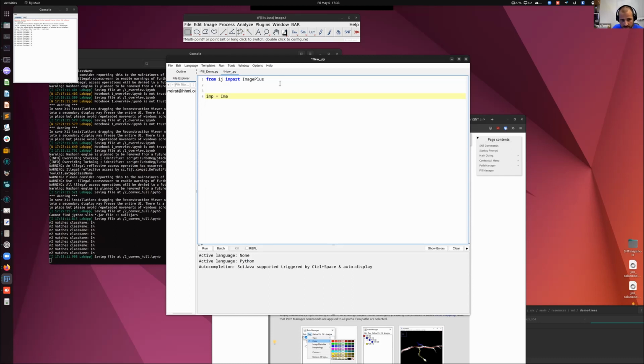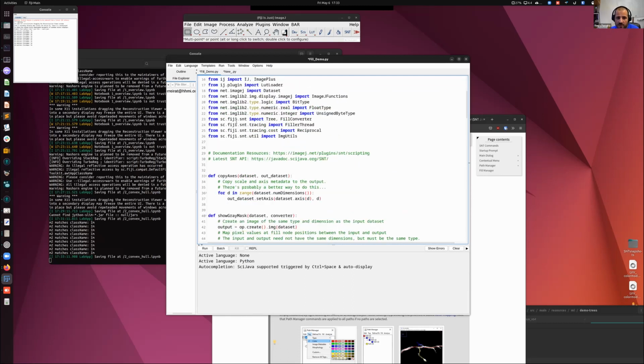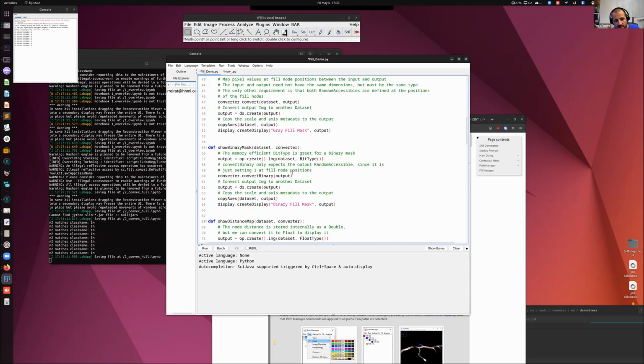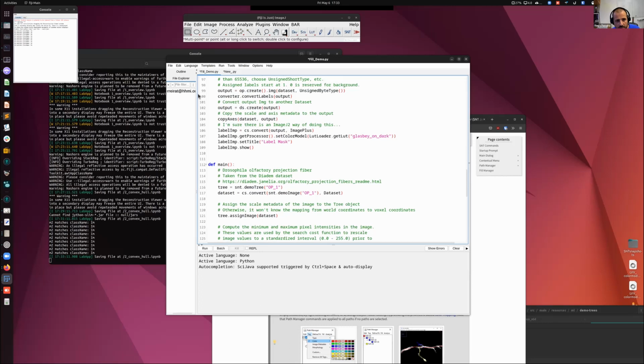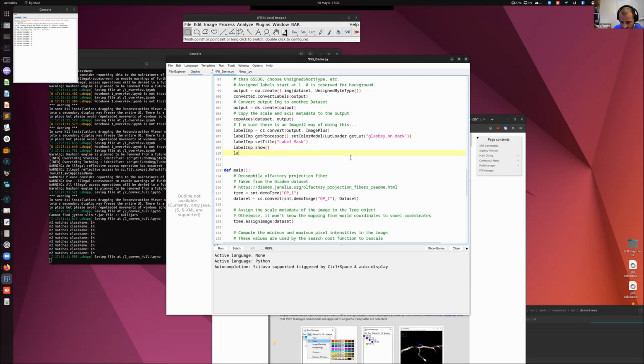Yeah, it's not working. Okay, anyway, on your installation, it should work. Basically, as you are typing, you should have autocompletion for the imports that are available, and autocompletion for the methods that you are accessing. And we also have types and declarations for JavaScript in case you prefer to use that instead.